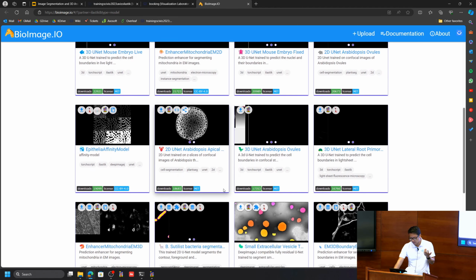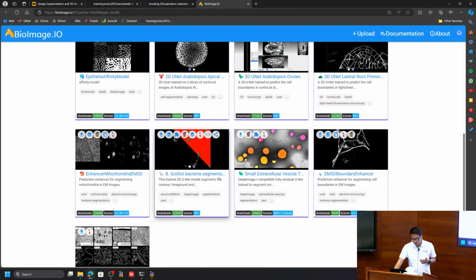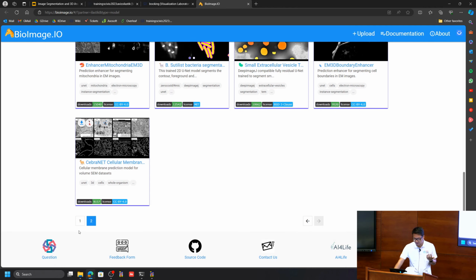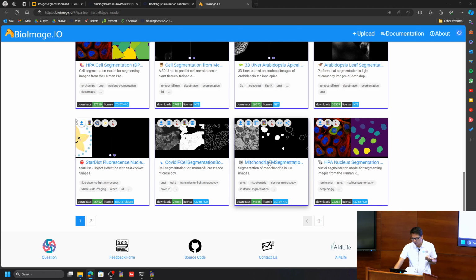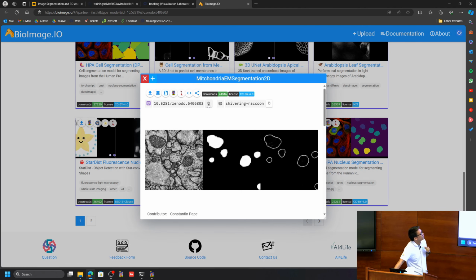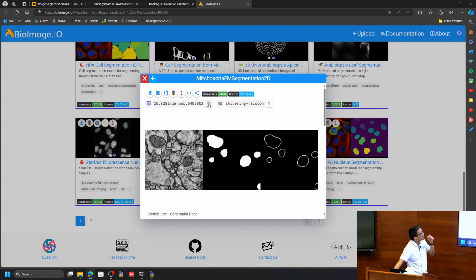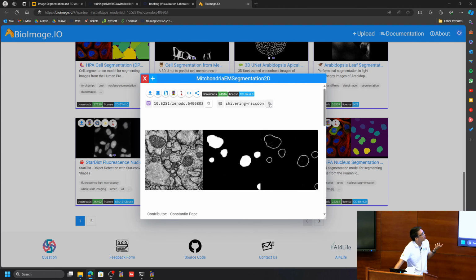Right now there's not a lot. So these are all the models that are out there, but this is pretty new, so hopefully in the near future it's going to keep increasing. But this is super low effort stuff, right? Because you don't really have to do anything except copy the model. So to copy the model, you just click on the model. And you see here, there's two things, right? One is a DOI, like a unique identifier, and some unique name. So you can just copy this, and that's all you need.